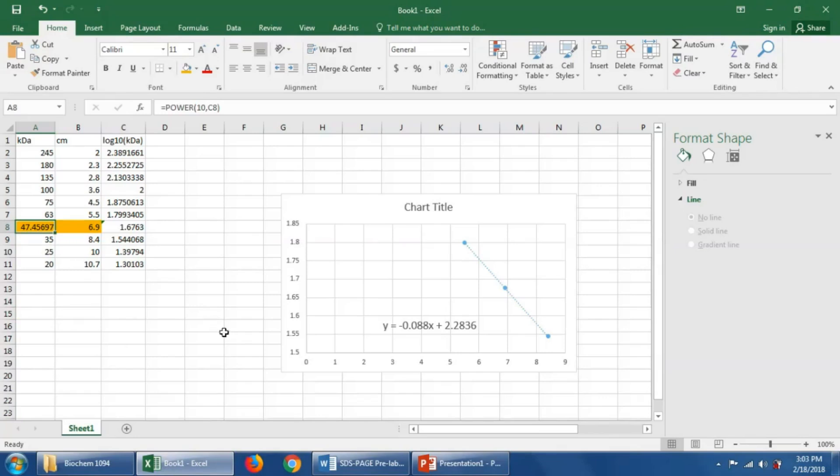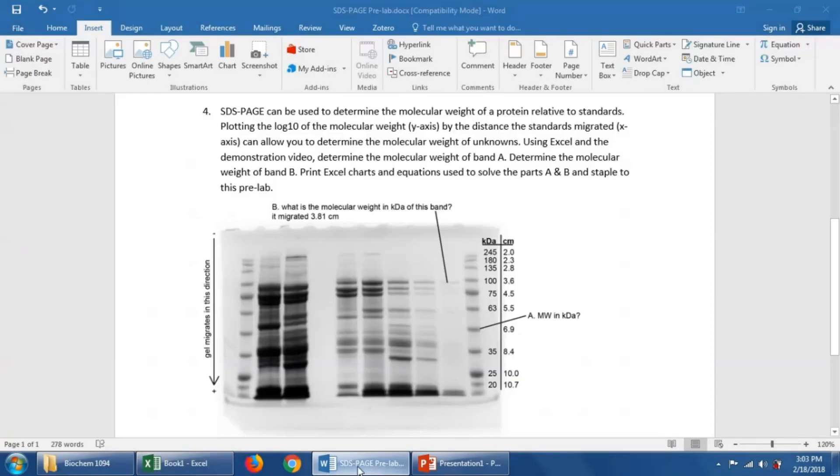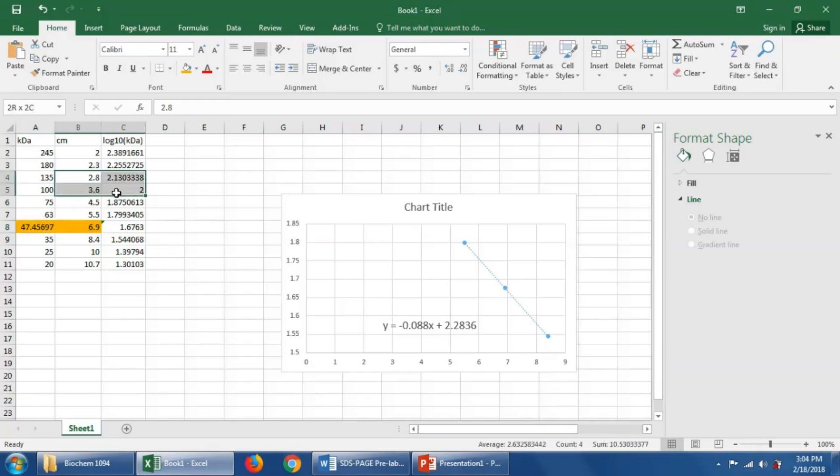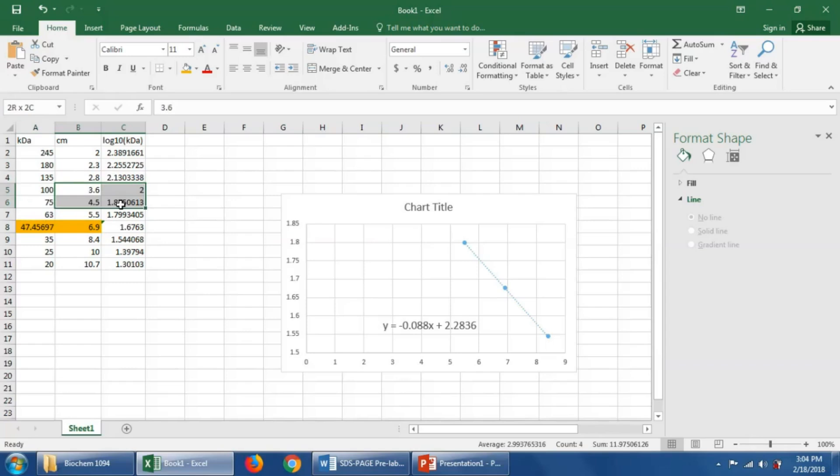Now it's going to be your job to figure out what is the molecular weight of this band here, B. I'm going to give you one last pointer here. So when we do the graphing, we could again select these two bands and make a graph between those two bands.